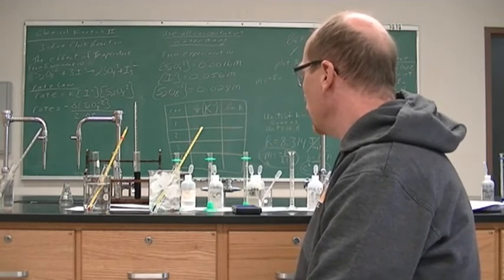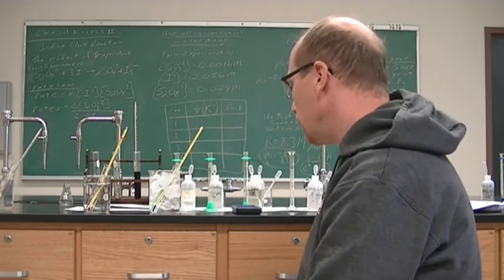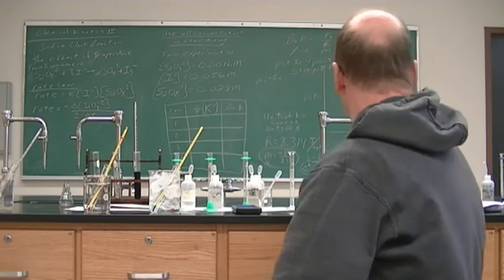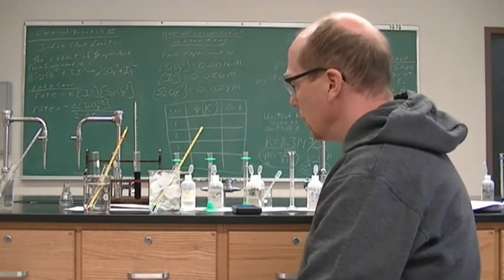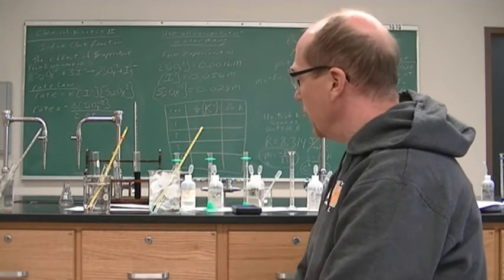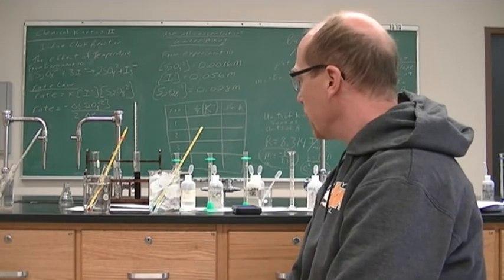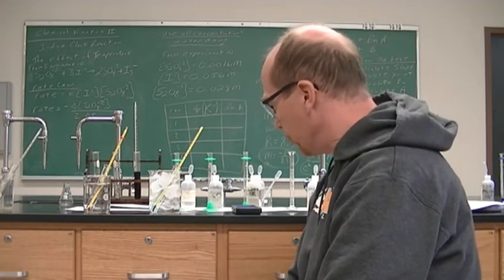All right, and so 7.5 minutes. All right, so if our rule of thumb is going to hold up here, this should be changing soon. The ice bath should be turning blue real soon.